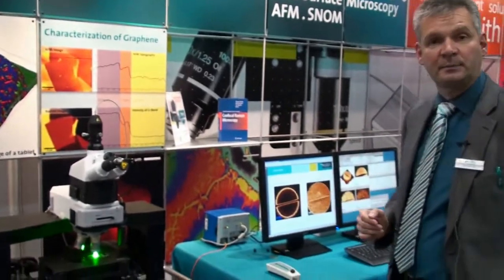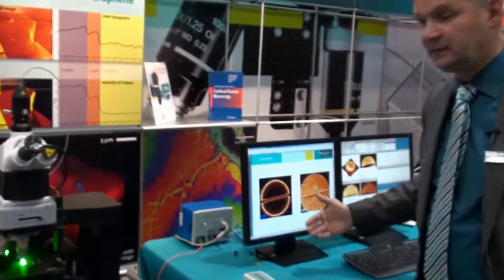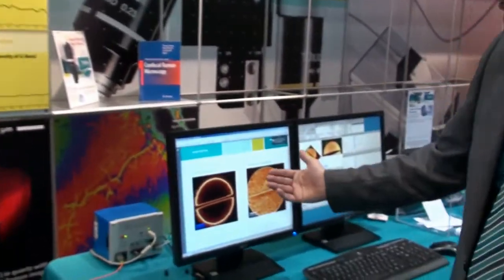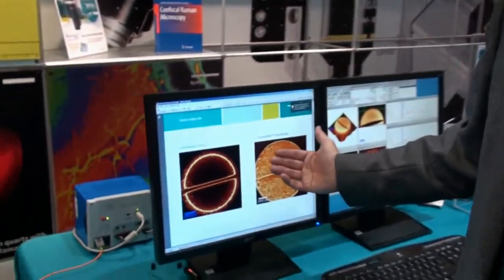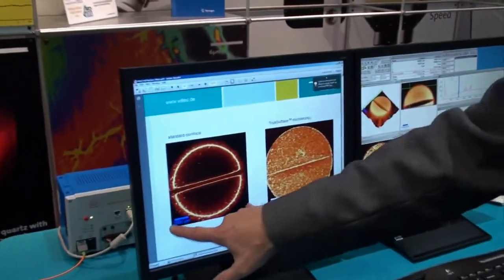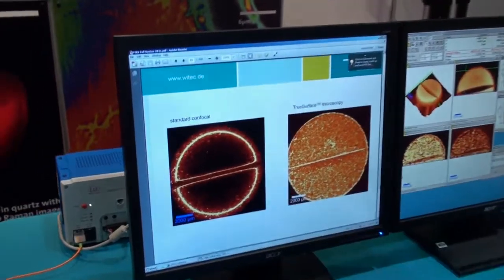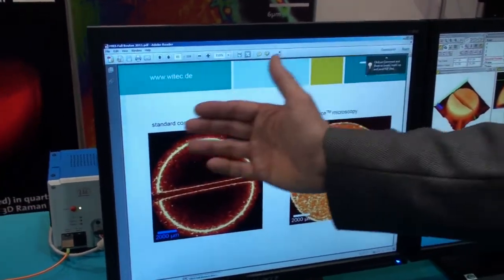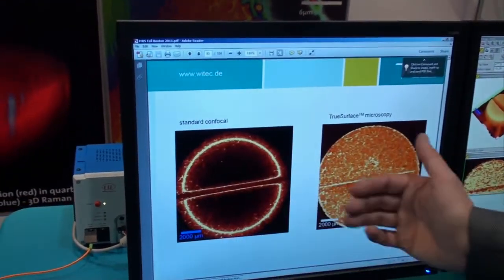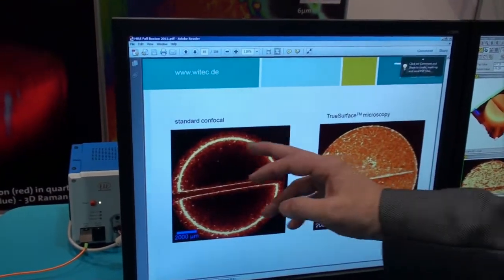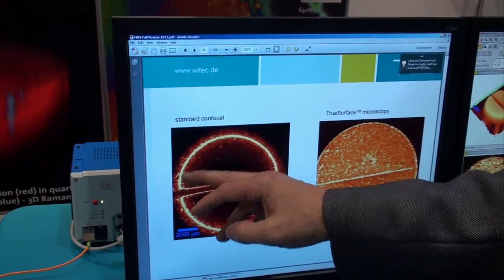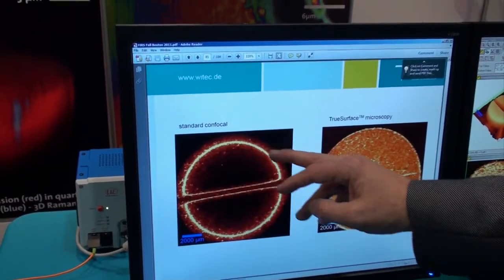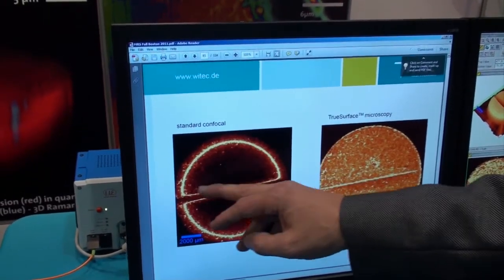In this example, this is a measurement of a pharmaceutical tablet — about 10 millimeters in size. You can see that in the standard confocal measurement you only get information from areas that are in focus.